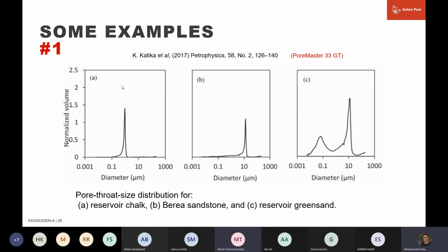But this is interesting because they have pore size distributions clearly replotted, not in our software, but they've taken the raw data results and have plotted it up in something. I don't know whether it's Excel or something like that. But you can see here they call it pore throat size distributions, because remember the mercury has to penetrate through throat pores.